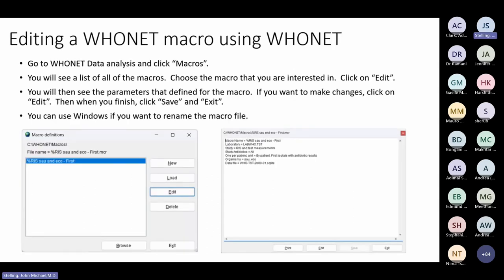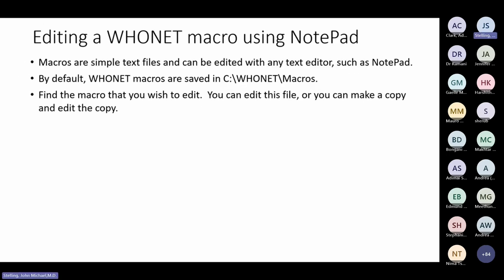That is how to edit a macro using Hoonet's Edit button. You can also use a text editor such as Notepad, WordPad, or Notepad Plus. Macros are simple text files and can be edited with any text editor. By default, Hoonet macros are saved in the Hoonet macros folder. Find the macro you wish to edit, then double-click or open Notepad. You can edit the file or make a copy before editing.